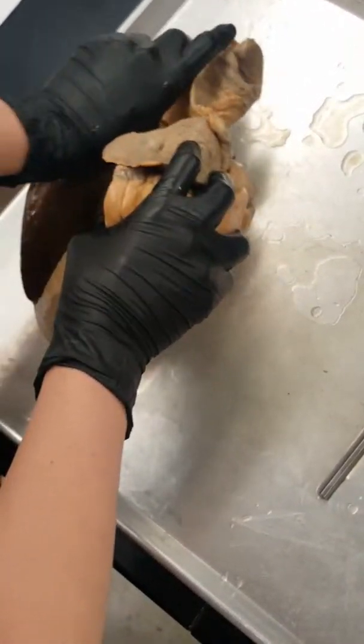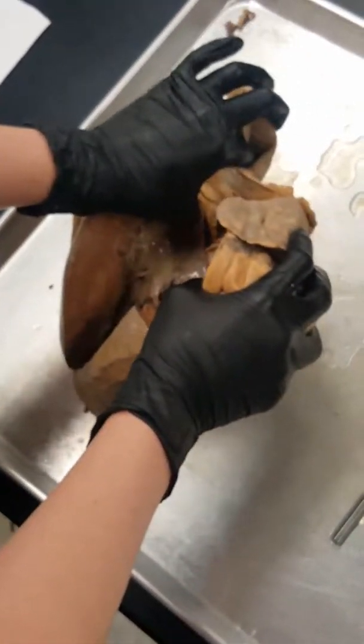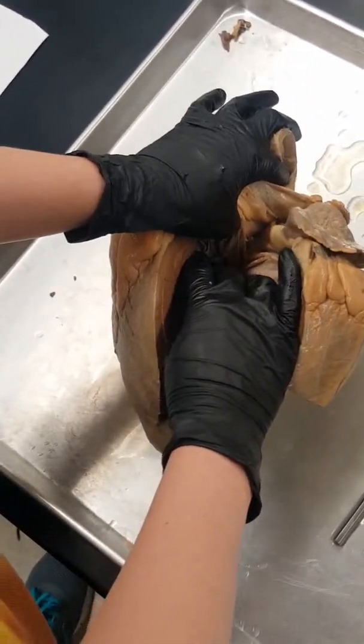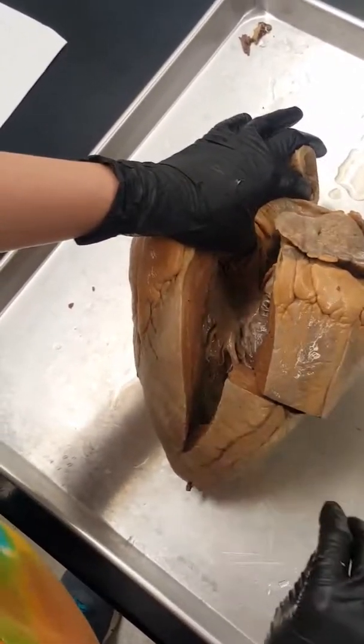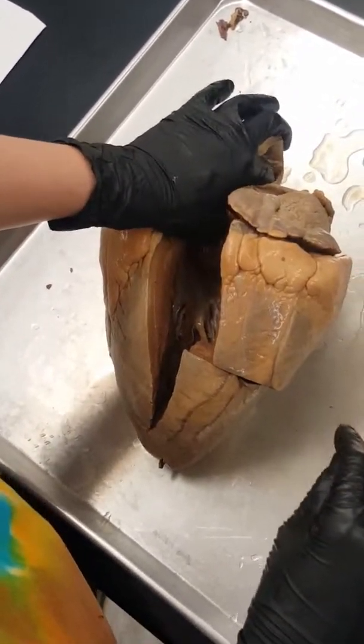These striations of muscle are going to be the trabeculae carneae — it's this kind of interweaving of muscles, which is what it looks like. And then right up here is the musculi pectinati, which is just these muscles arranged in straight lines.